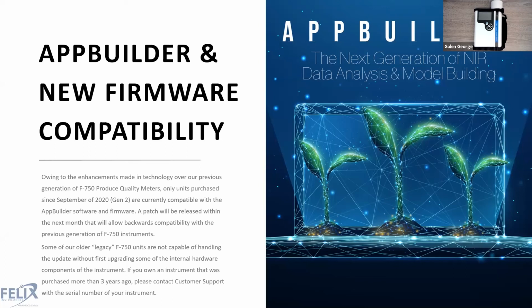So if you own an instrument that was purchased more than 3 years ago and you are curious about updating to the new firmware and using AppBuilder, then please reach out to our customer support and include the serial number of your instrument in that email. On a case-by-case basis, we will go through and assess what it's going to take to get your instrument up to the newest firmware and AppBuilder software, and we will provide any information back about that.